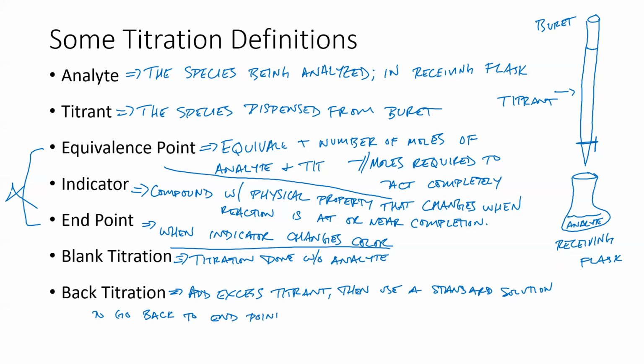Right? And so if we've added excess titrant, this is past the end point. So instead of our phenolphthalein being just a pale lilac purple like we like to see it, our phenolphthalein is deep magenta, and we're going to titrate it back to where it's colorless.